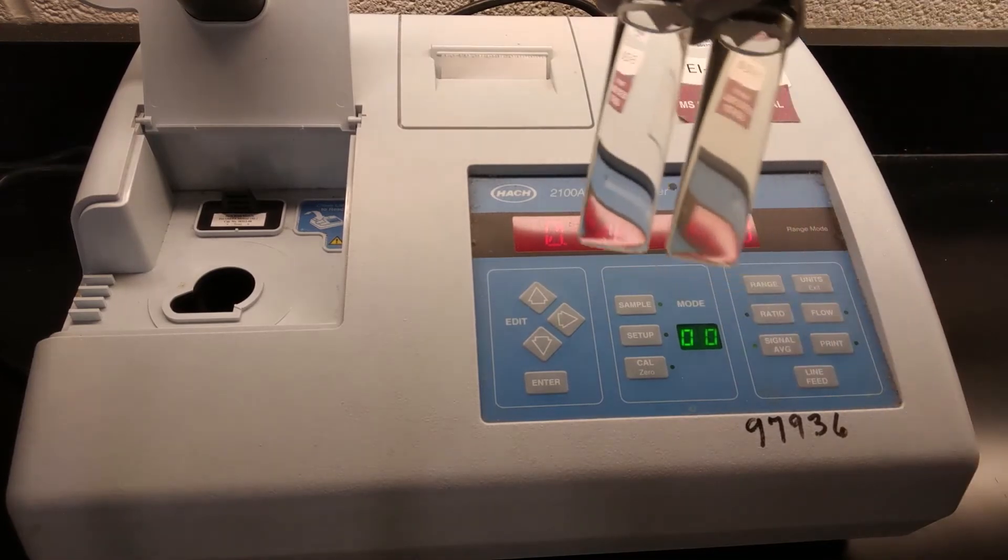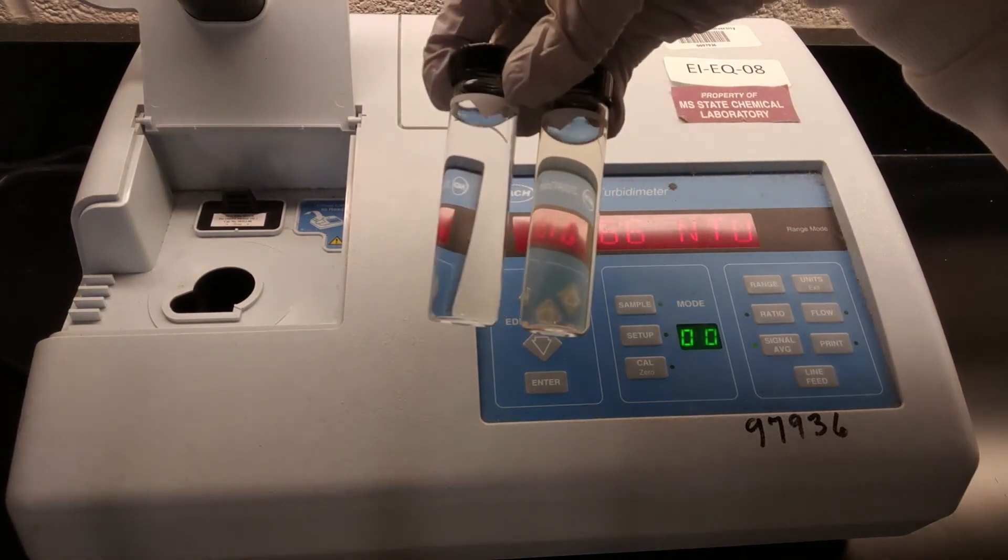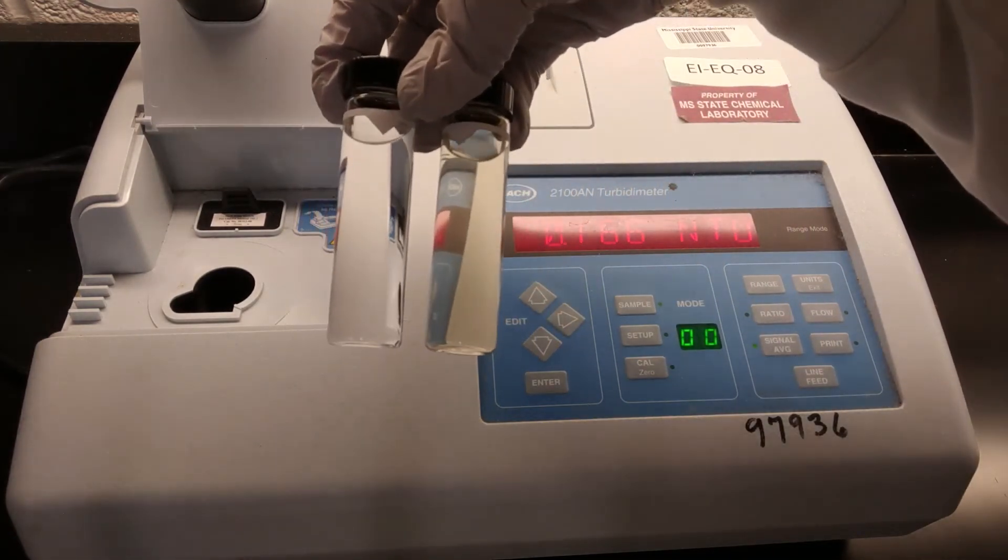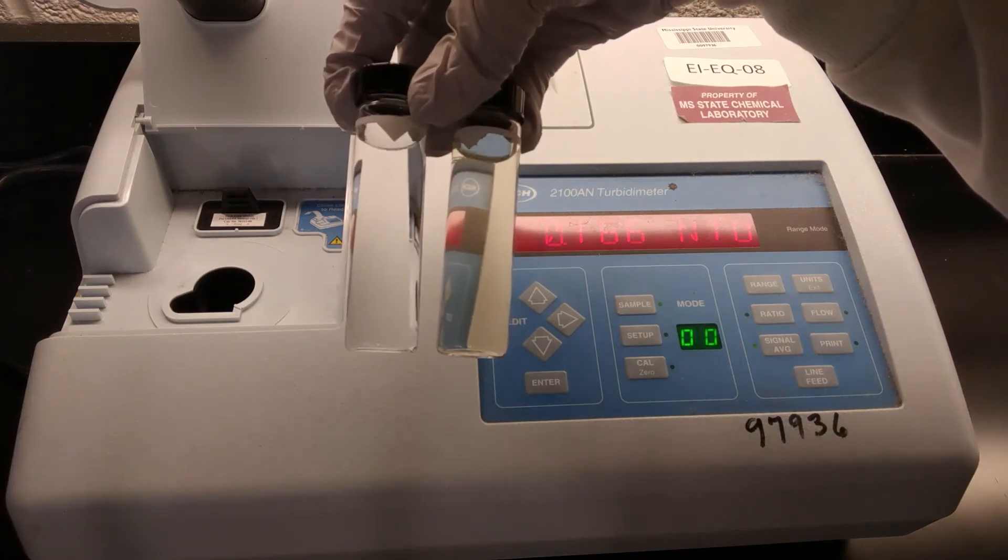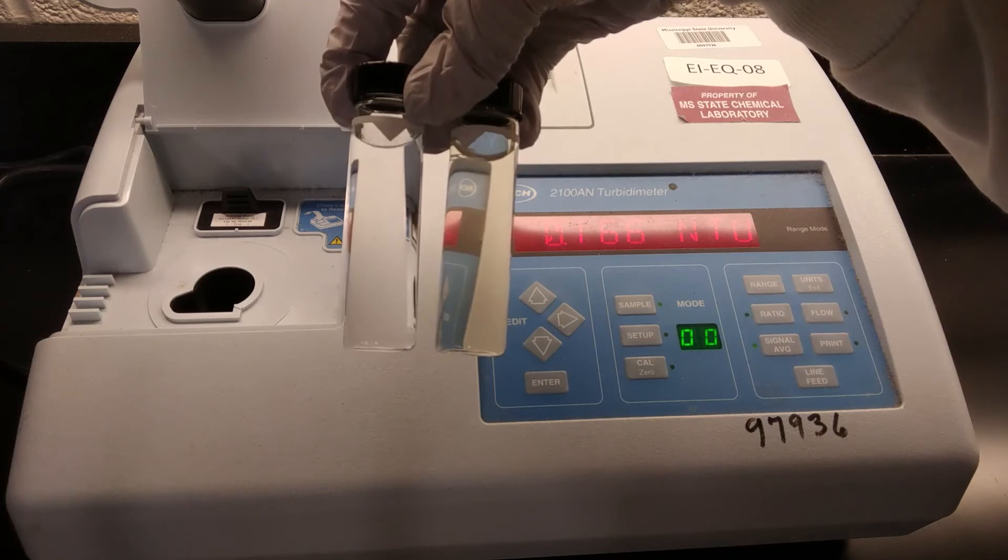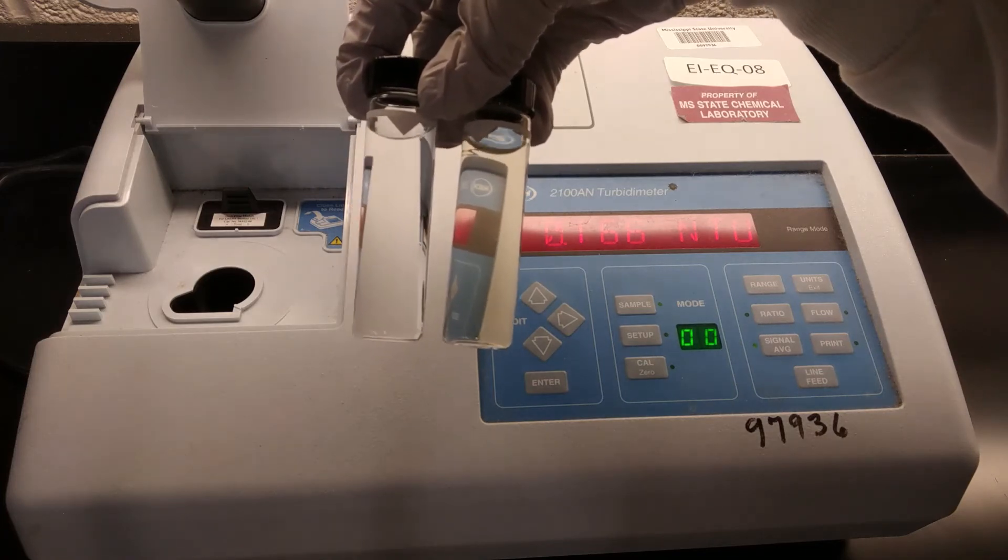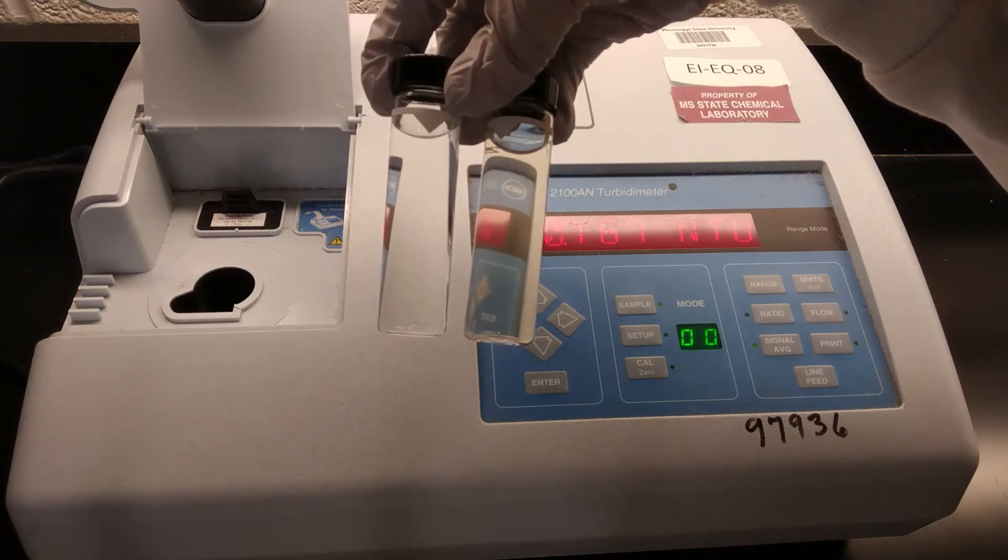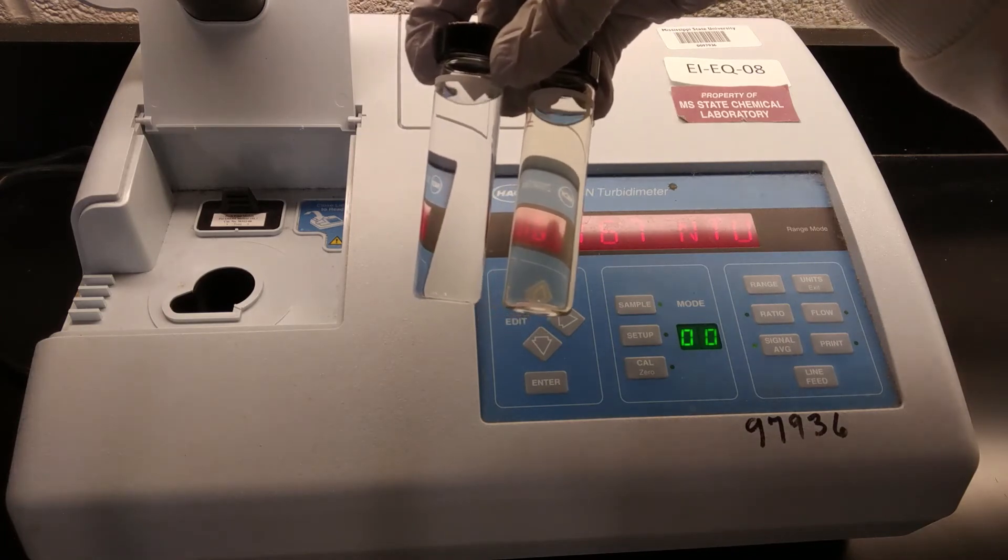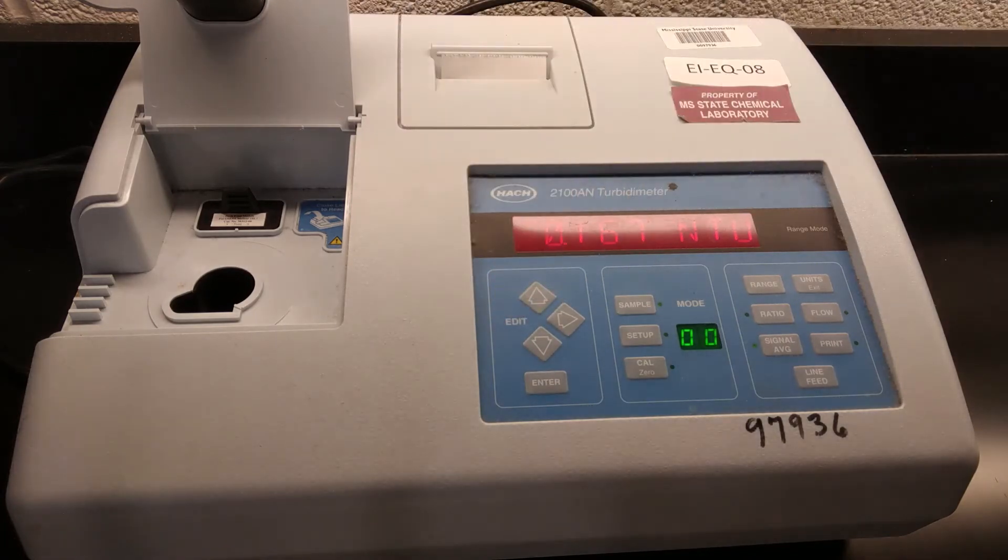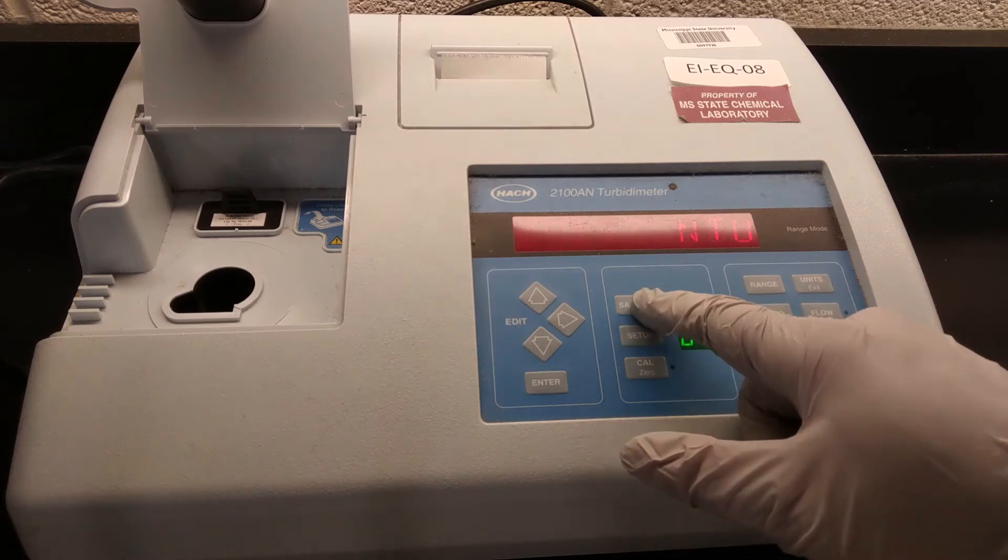So I have my two samples prepared. On the left is our blank. You can see it's pretty clear. On the right is our irrigation or runoff water. It's a little bit yellowy green and has some cloudiness to it. So we should see some difference in the measurements that we get here. So to measure, it's not that different from our calibration. We just want to go to sample mode.